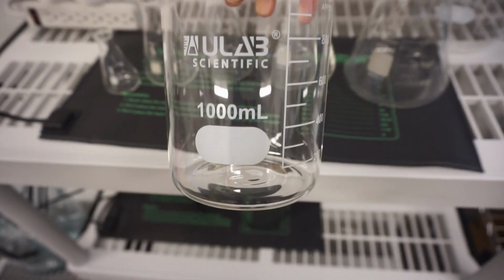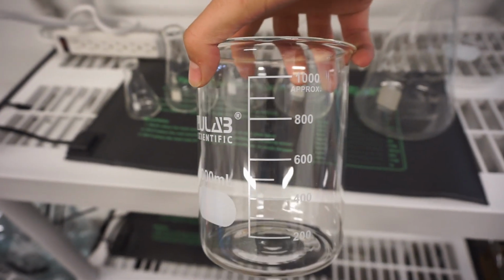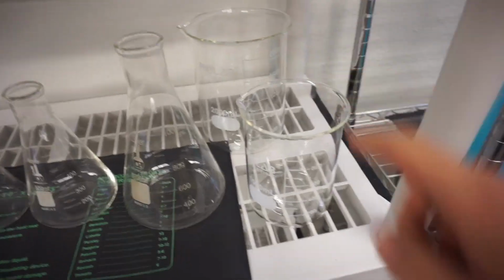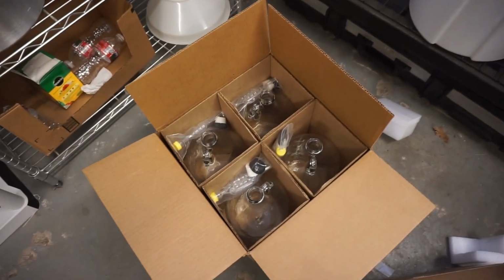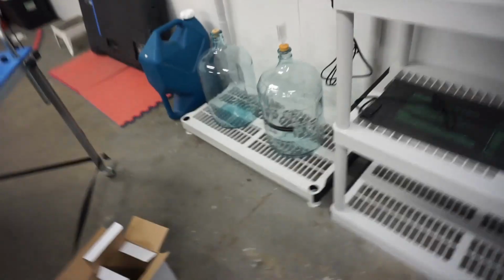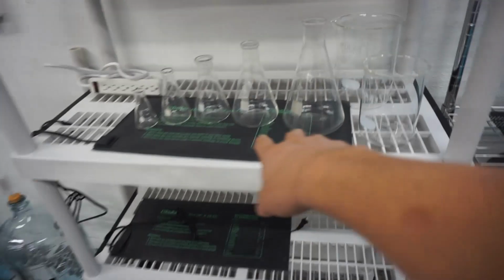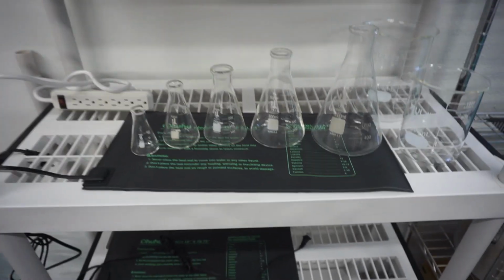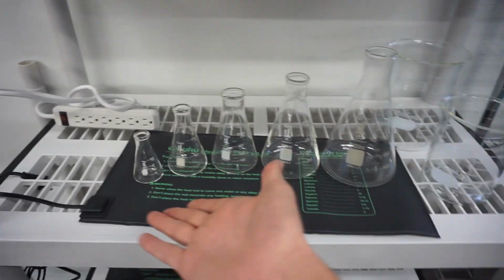These ones seem to be legit based on the reviews on Amazon, so I think these guys are accurate and true to their size, both the 1000 and the 2000 one there. And then I know that the carboys, those are clearly gallon-sized jugs, so I know those are legit. These guys are the only ones that may be a little off, but that's what you get when it costs 16 bucks for a set of 5 like this.